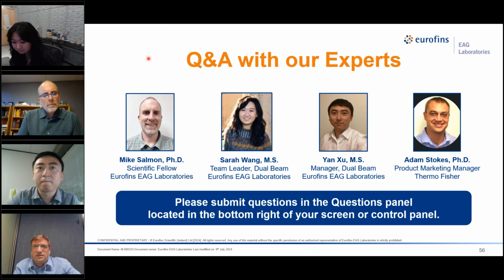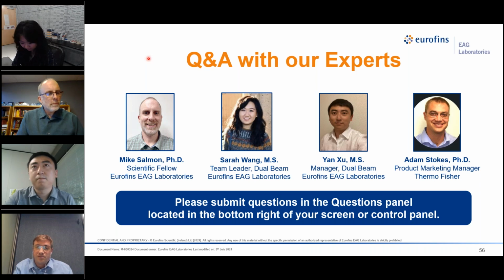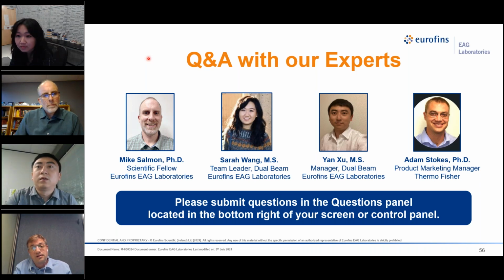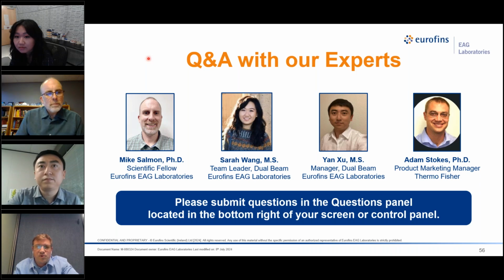Yeah, great question. So yes, the different ion species allow for different use cases in different application spaces. Argon's really good at cross-sectioning for large volume cross-sections across similar materials, as mentioned earlier. Oxygen has a chemical and a physical effect when milling, and so we use that to our benefit. A lot of the time, we do that on organic materials like packaging or life science samples, and it's a very, very surface layer of an oxide being formed. And then nitrogen is still in the research phase. We have had customers use it for nitrogen doping and creating some nitrides, but that's still an unexplored space.